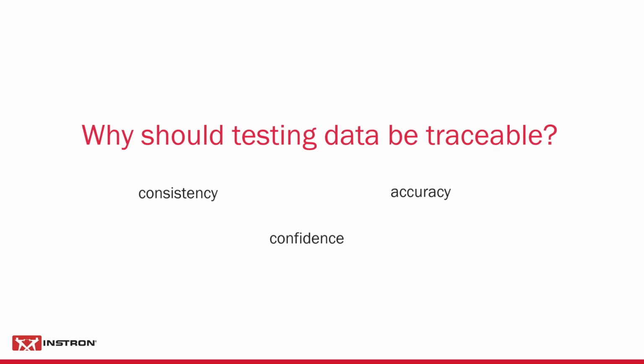And finally, confidence comes to my mind. So lab managers can ensure that users did what users said they were going to do. And lab managers have the confidence that they're able to prove it in an audit. So ultimately, generating traceable data means that your laboratory and your company are held to high quality standards and create quality products. So while the US FDA does set strict requirements to enforce traceability, we believe that almost every laboratory, if not all labs, could benefit from this new Bluehill traceability module.